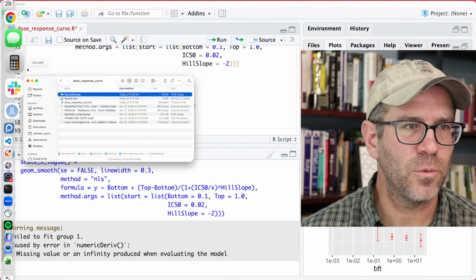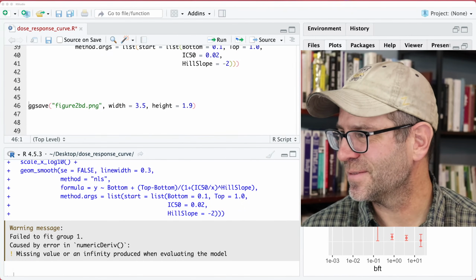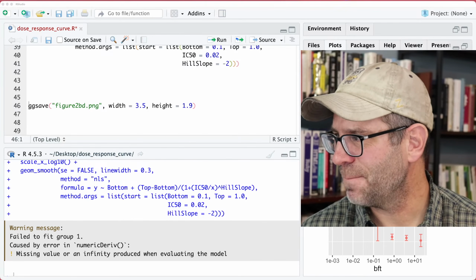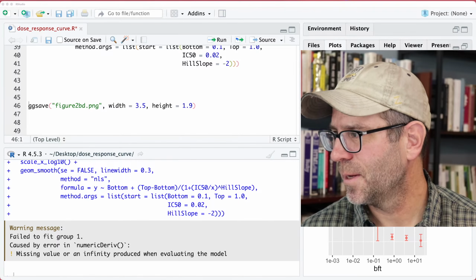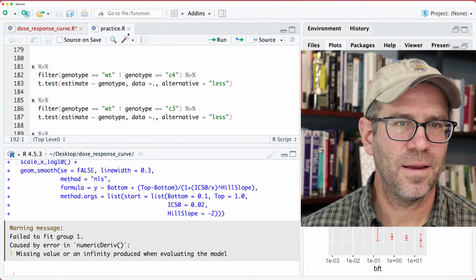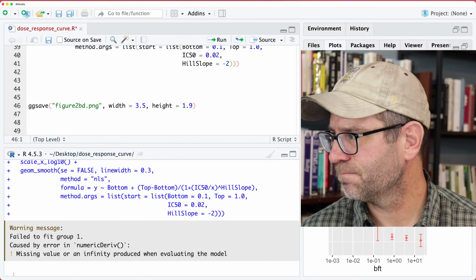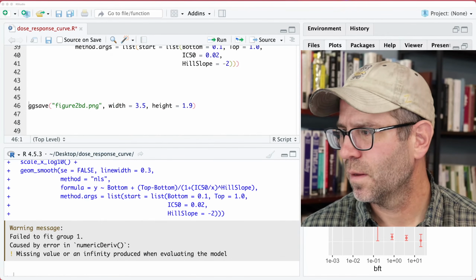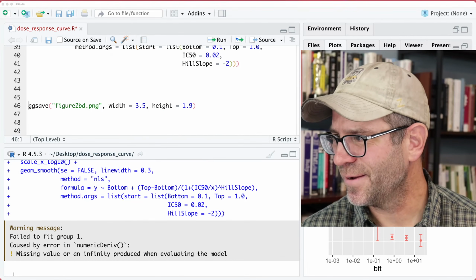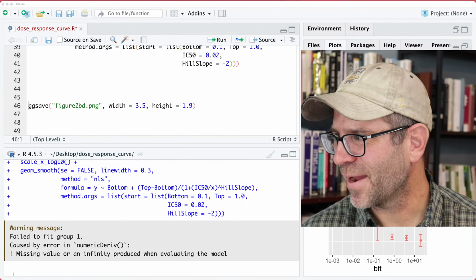Okay, I am going to, if you don't mind, cheat in this for the sake of time. Let me pull up my notes. And let's see here. Let's see what I did. Sorry, I don't like having to phone a friend by going back through my old notes.